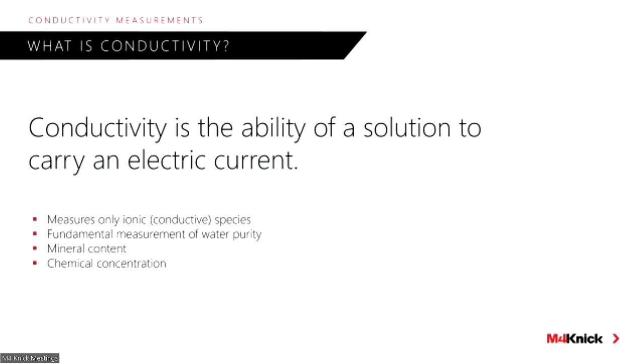And simply put, conductivity is the ability of a solution to carry an electrical current, right? It's measuring ionic activity. It really doesn't care specifically what ions, so long as those ions are conductive, right? So it's a non-specific measurement, but it's influenced heavily by different ions, different species. And of course, it's a fundamental measurement of water purity.